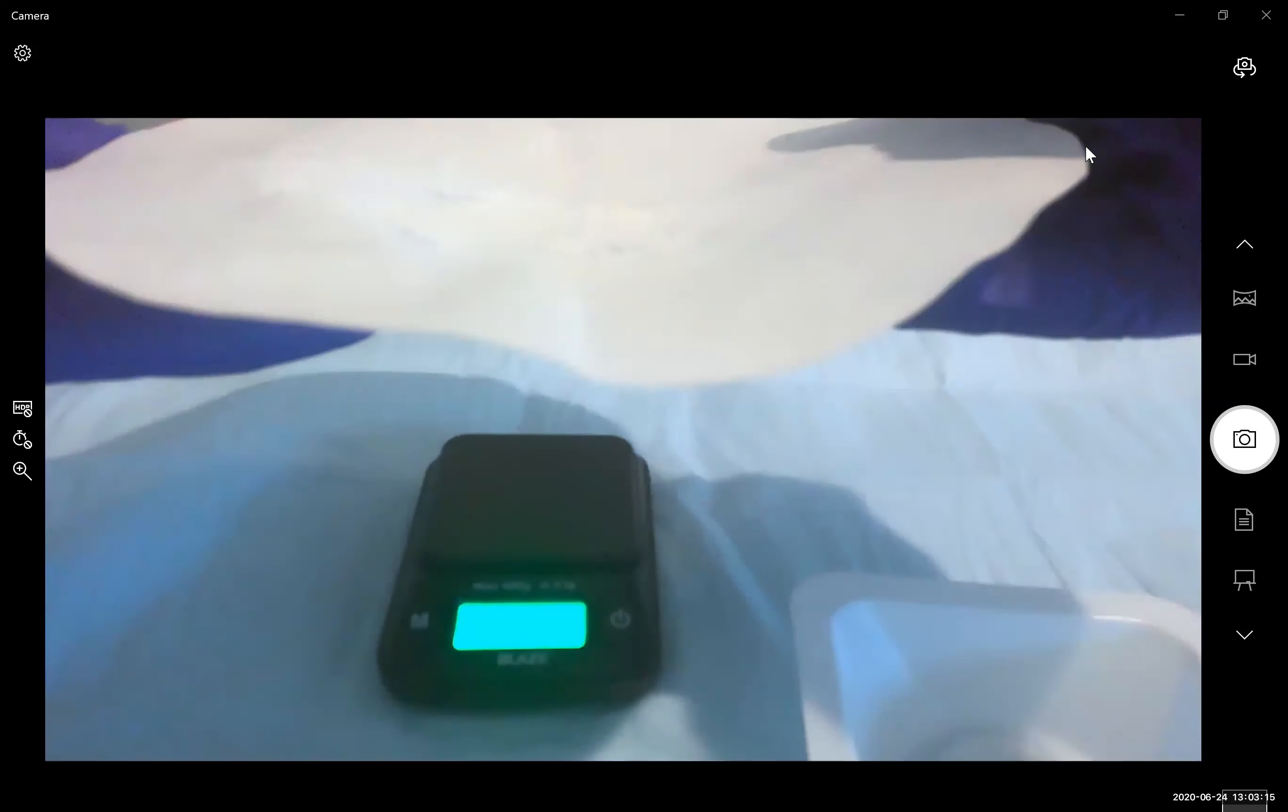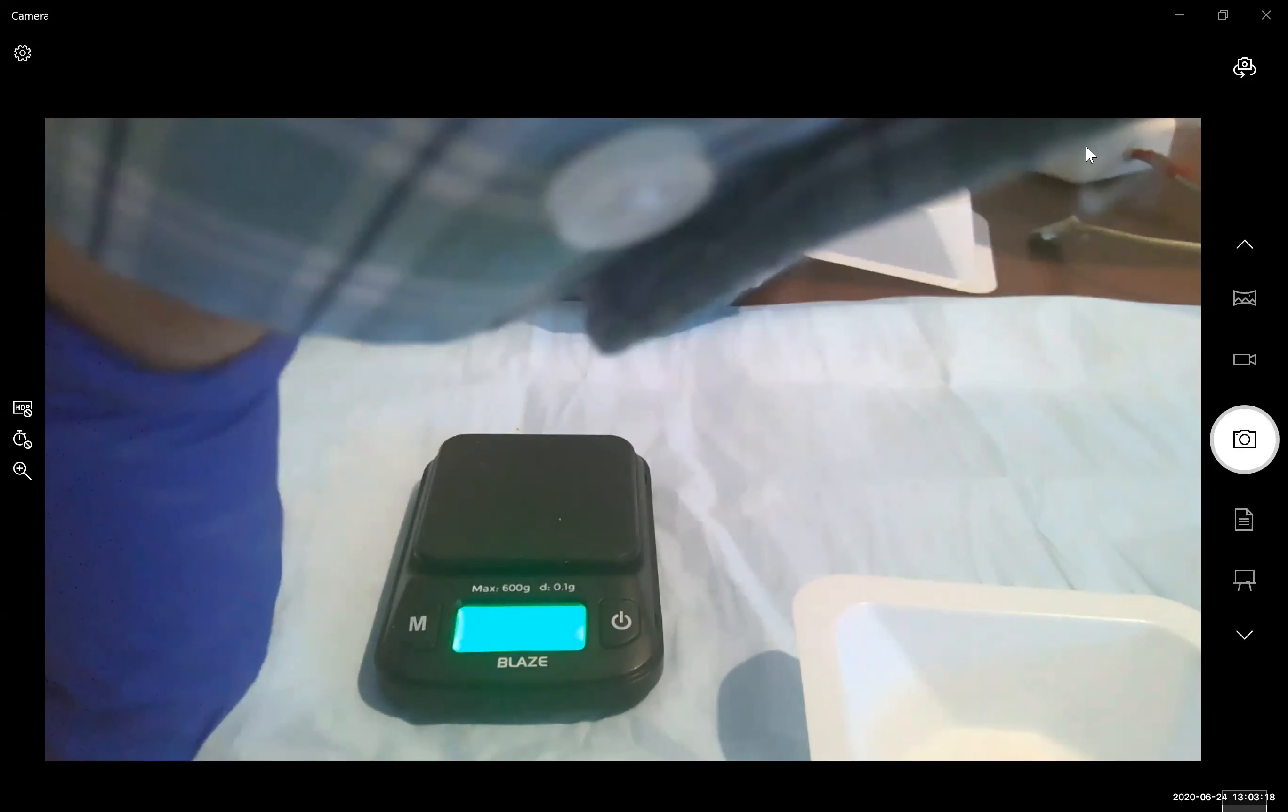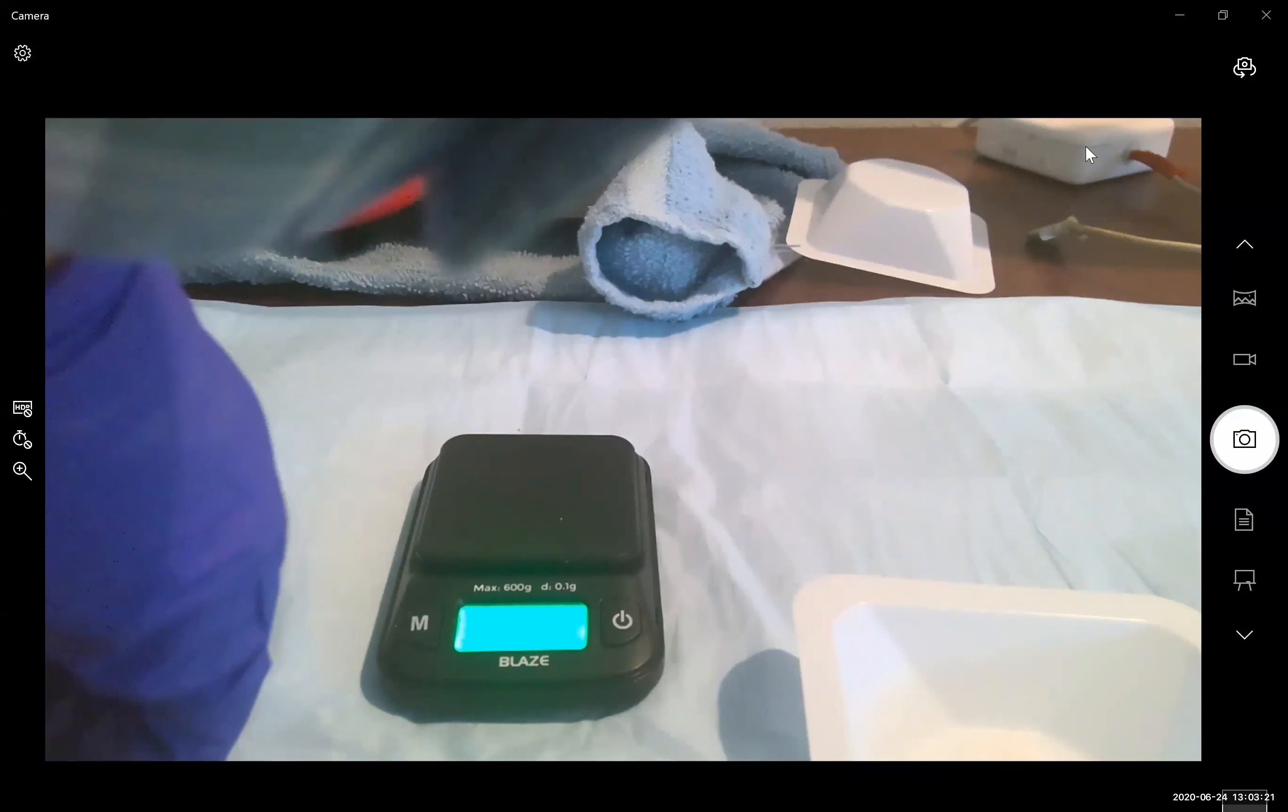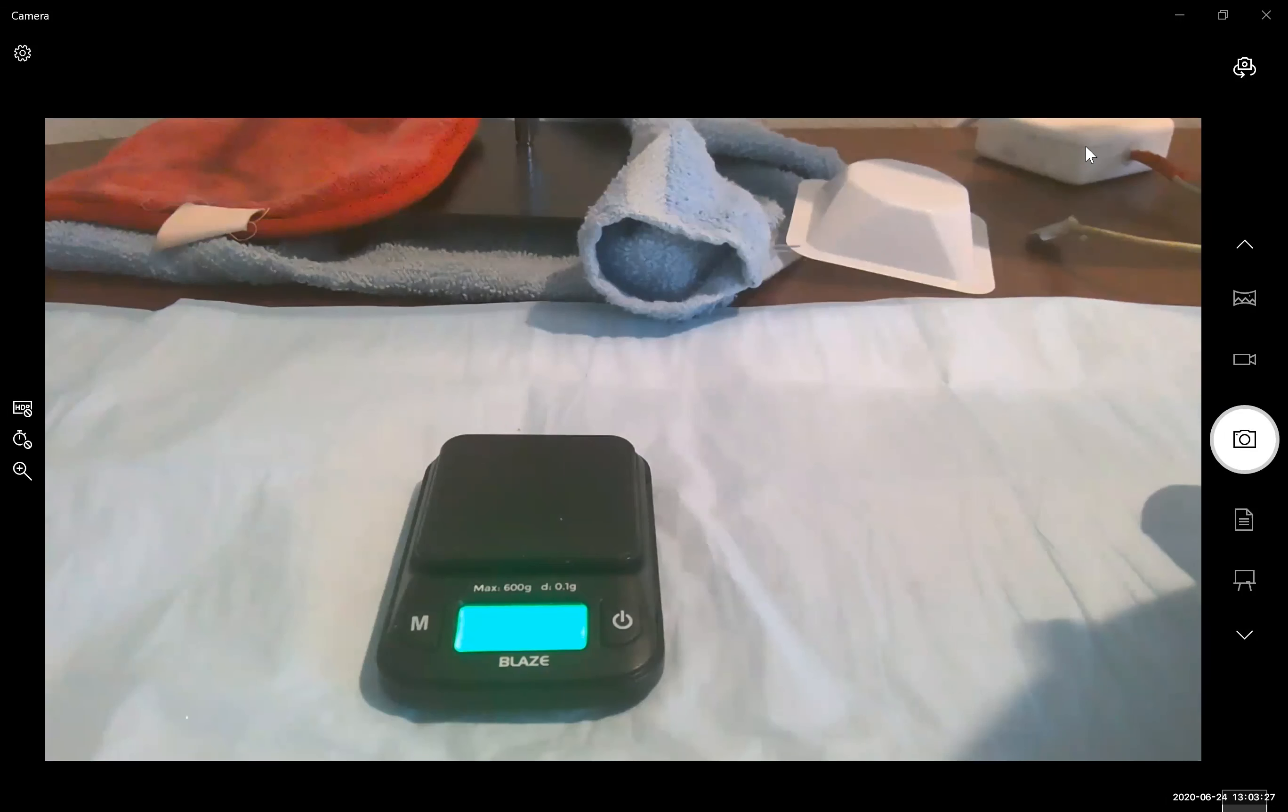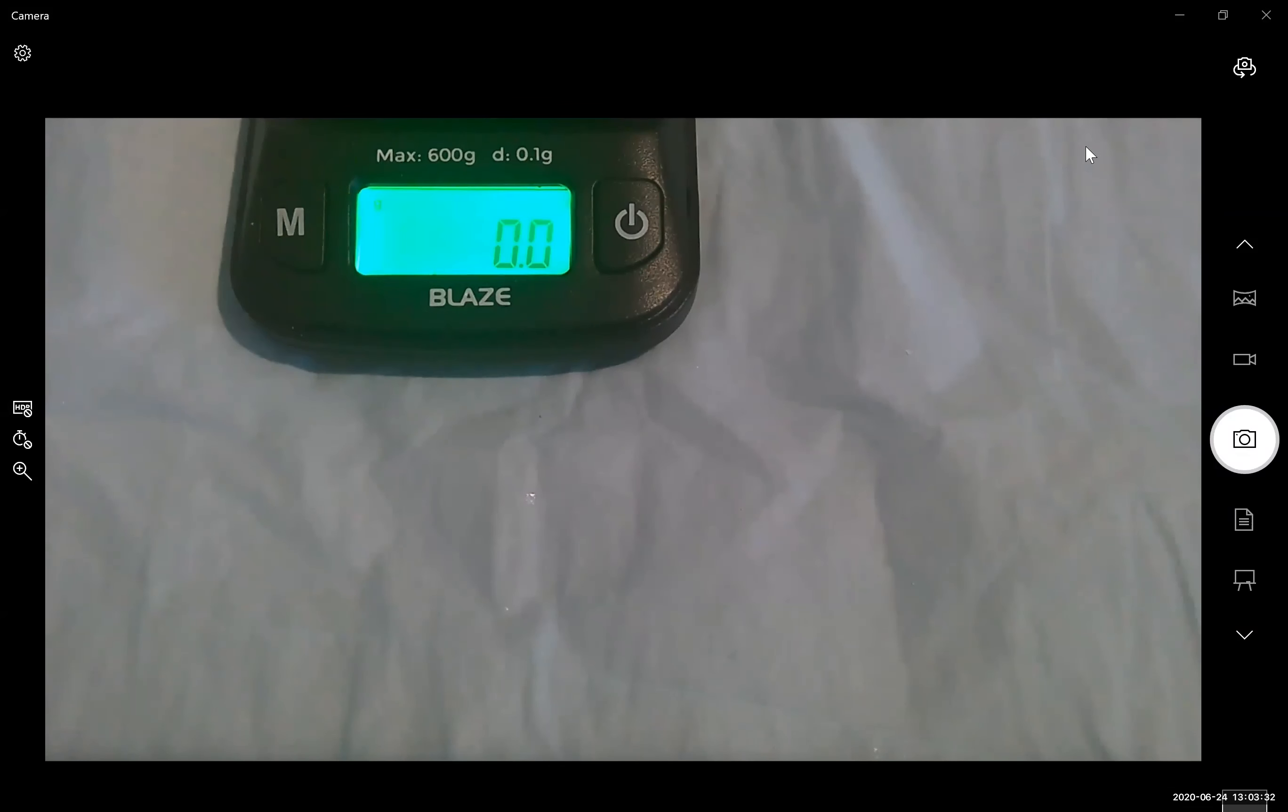We now have this nice dry solid and now we are going to record the mass of our solid plus our weighing paper plus our watch glass. So I've zeroed my balance. Everyone see the zero zero.